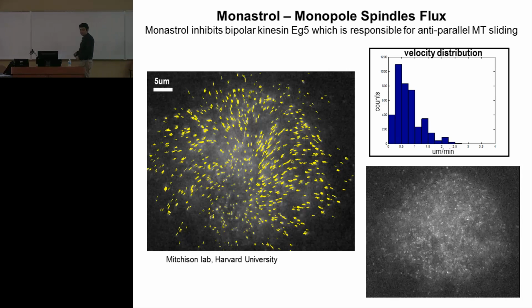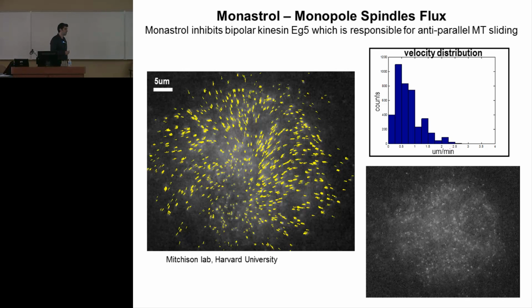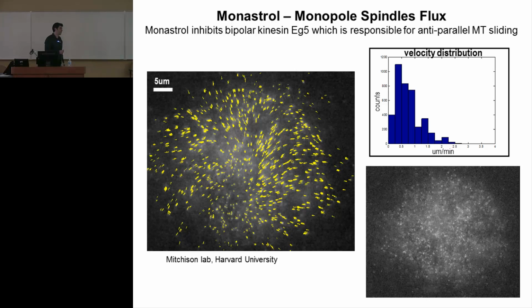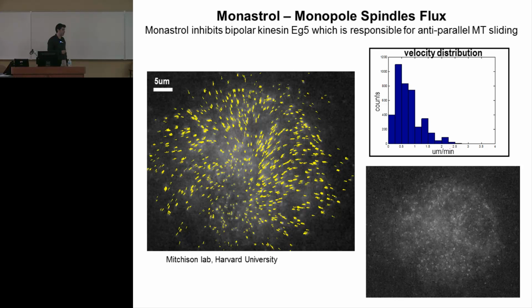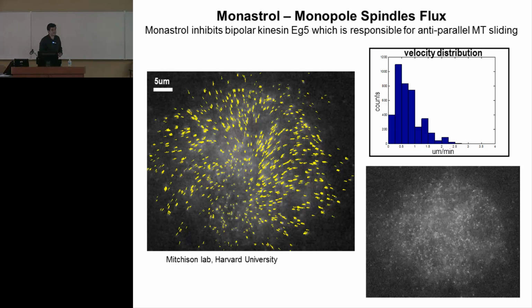In this movie, you are assuming the speckle locations are known, like the detection is done? I detect the speckles. And so you have a separate method to detect these? Yes. And then track, yes.